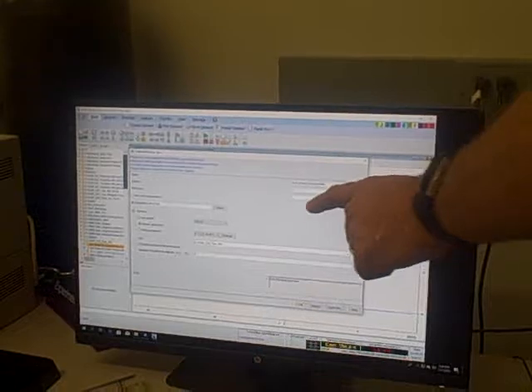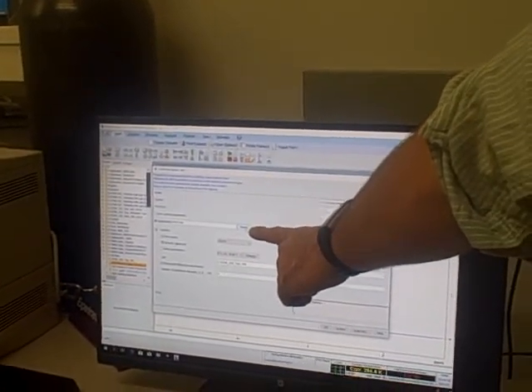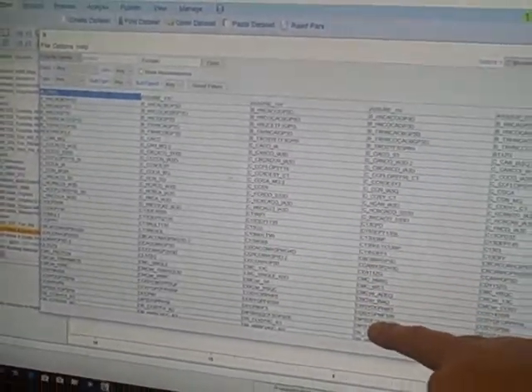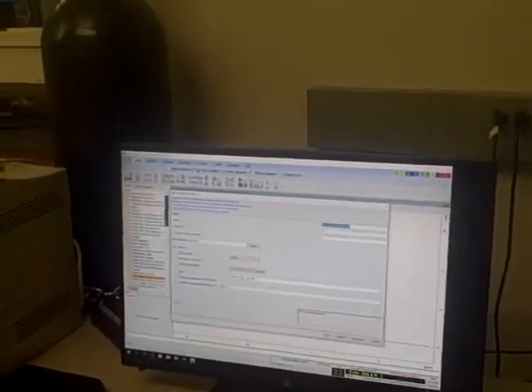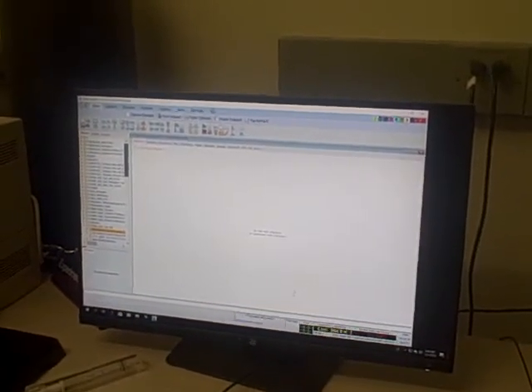If you need to have a different type of experiment other than what's pressed in the experiment button, you can select and pick an experiment from the list here. Typically your instructor will have done this for you though, so just hit close. Okay, hit OK. And this creates your new experiment window.